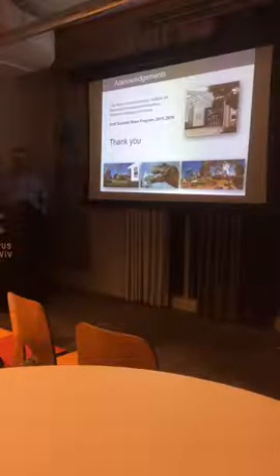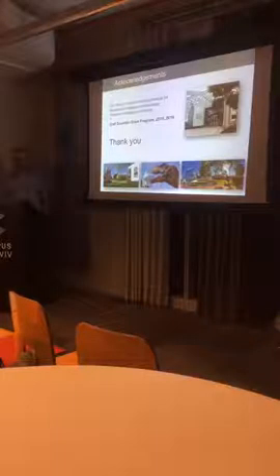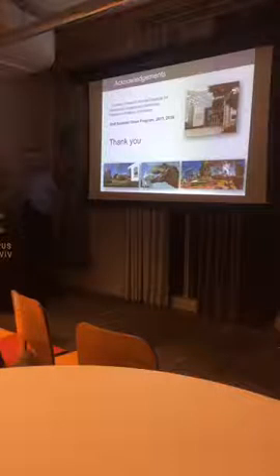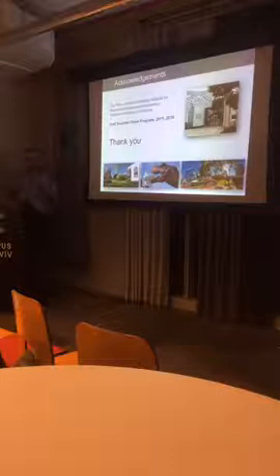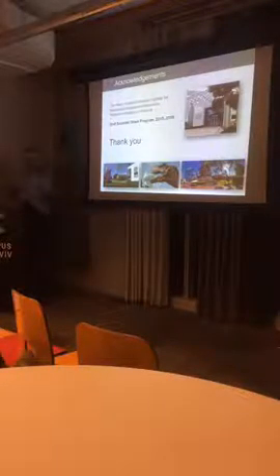So it seems that a lot of the work is actually image processing through, as you said, ImageJ or other applications. How open source in your mind is that? You say it's very simple, but unless I can show you a code in ImageJ. Right. ImageJ is absolutely free. It's open source, and the code is about 60 lines. You collect the data, and I have different variations of the code on ImageJ that I can give you. You can use it and also modify it.